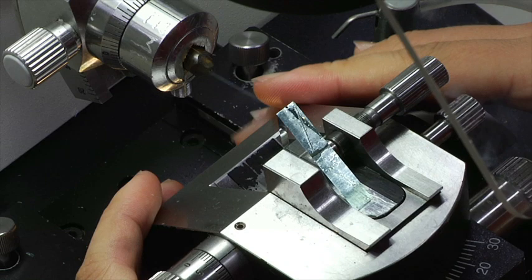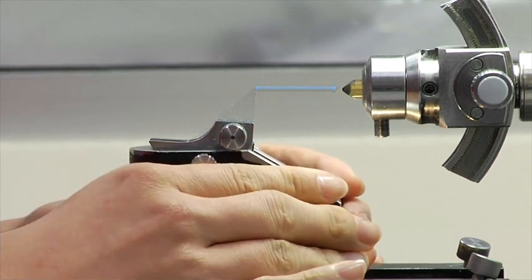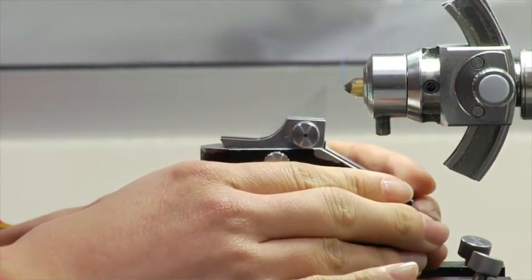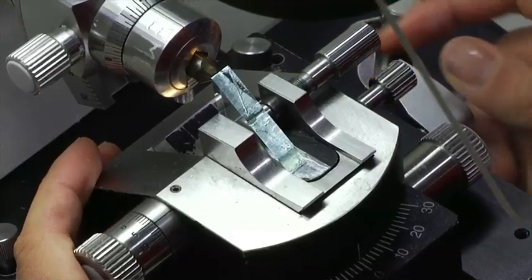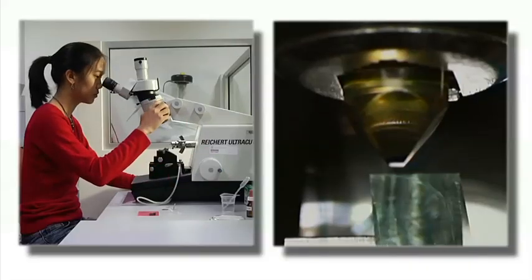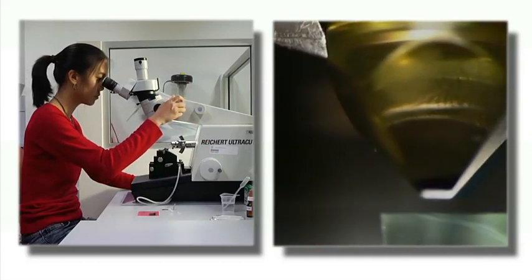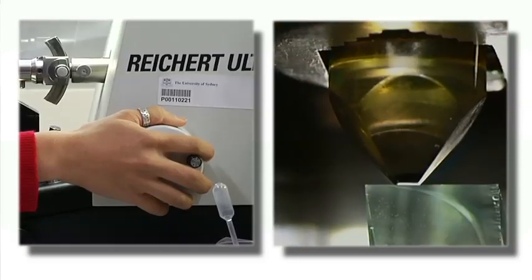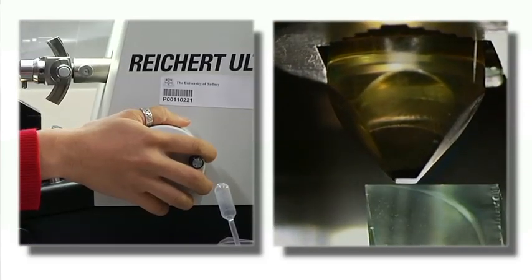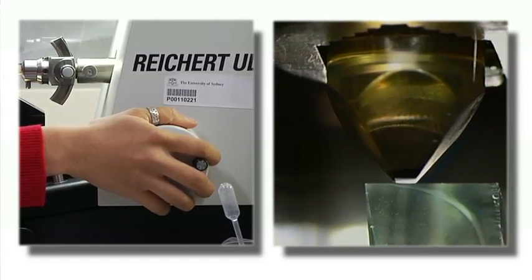Unlock the knife stage. Ensure that the block face is not positioned above the knife edge, and slowly push it toward the block until the knife is around half a centimeter from the block, then lock the stage in place. Increase magnification to ensure better judgment of distance and make sure that the knife and sample are in the same focal plane. Focus your view on the knife edge, not the block, and turn the hand wheel to have the sample in focus.